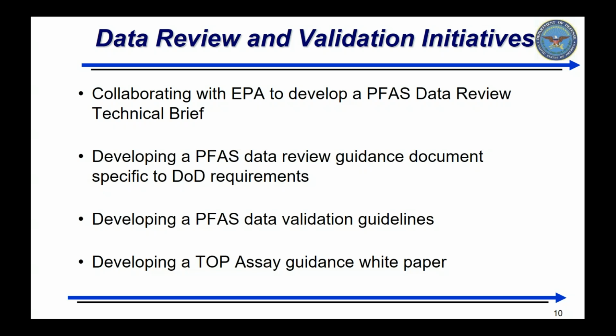As a result, we are collaborating with the EPA to develop a PFAS data review technical brief, and the EDQW is using this document as a basis to develop a DoD-specific PFAS data review guidance that is tailored to the DoD ELAP requirements. Following the creation of this document, the EDQW will develop guidelines for PFAS data validation. And lastly, the EDQW is developing a white paper to help DoD project teams understand one of the emerging PFAS methodologies, total oxidizable precursor assay, or TOP assay.